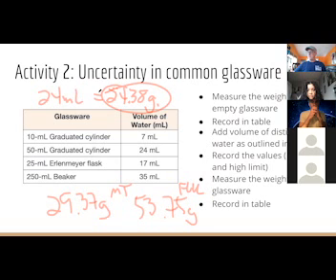But the beaker, basically you're flying by the seat of your pants because there are no measurements of 35 here, none. So you're on your own. Some people are going to get it close, some people aren't, but it's not your fault because this isn't designed to measure 35 mils. And that will be the point of the exercise, to show you that we don't measure small volumes with this. We do not do that. And there's a reason why we don't do that, because your error analysis is going to show you that it's a crappy way to measure it.